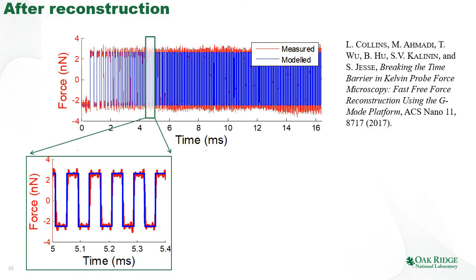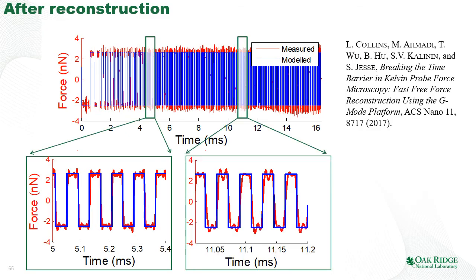And this is what happens if we try to do the reconstruction. So this is the reconstructed force on the time scale of milliseconds. So we have a perfect reconstruction. And this is going to the smaller time intervals, and we start to see the problems in tracing. So this is the time of the sweep, not the time of the segment. So here you can see that we're now operating in this microsecond region.